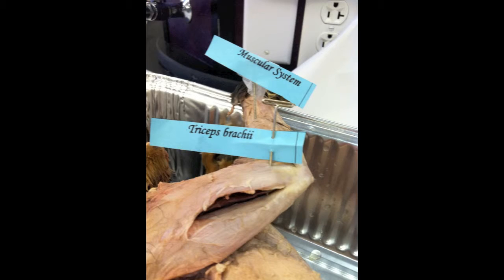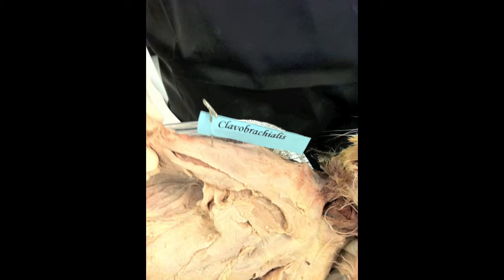The triceps brachii extends the forearm and the long head adducts the shoulder. The clavobrachialis provides forward extension of the humerus.